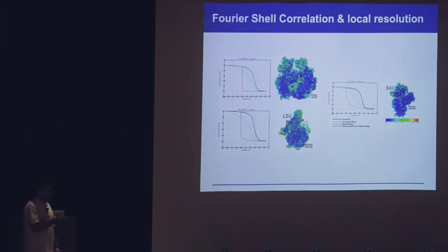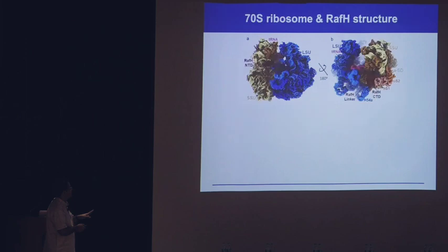Then once we got this, this is the way we estimate the resolution. It is a Fourier shell correlation at 0.143. That is your resolution cutoff, and one should definitely look at how the local resolution looks. What you are reporting in this is an overall value. That may not give you the right feeling. So this local resolution here says the starting range is 2.5, and we could see most of our resolution data is 2.5 to 3.5 angstrom. Okay, so we are certain that everything is okay.